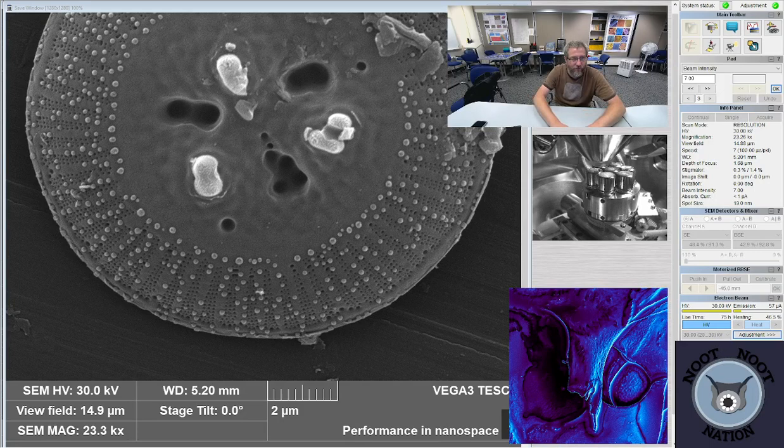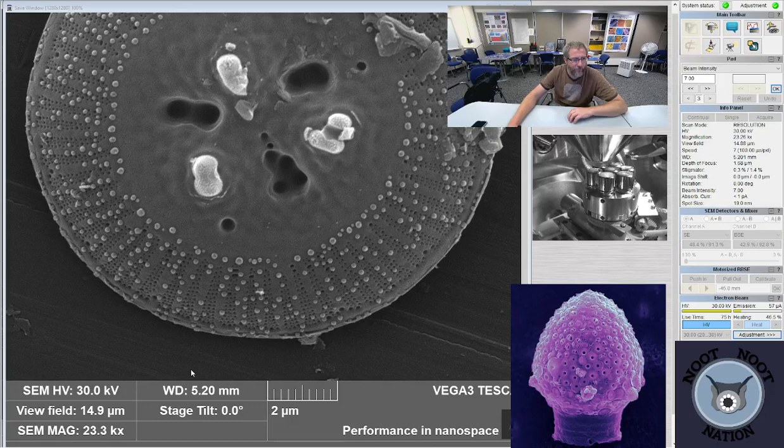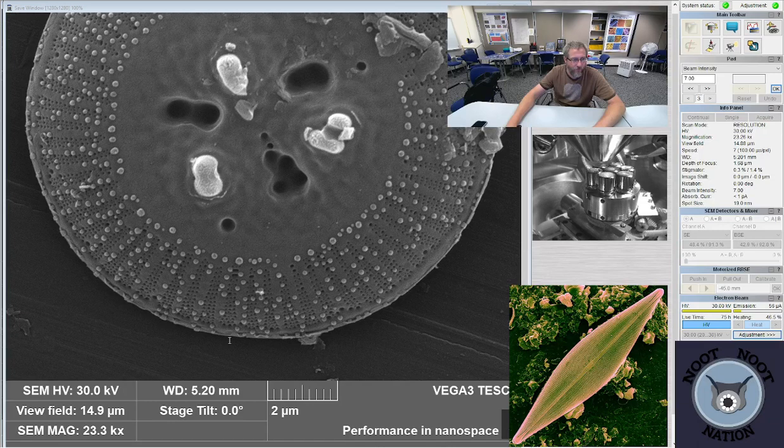These are Jackson Lake. Sorry, I need to put these somewhere. Good. Lindavia ocellata, external.